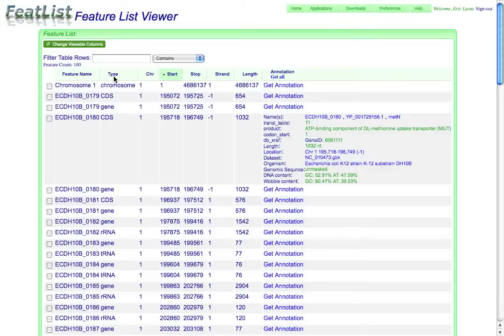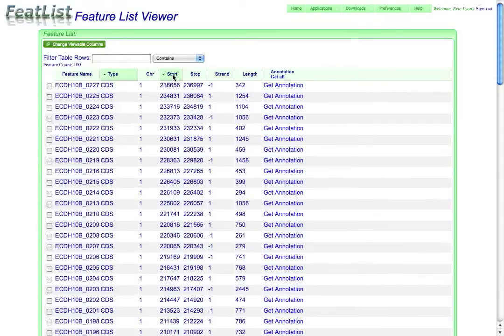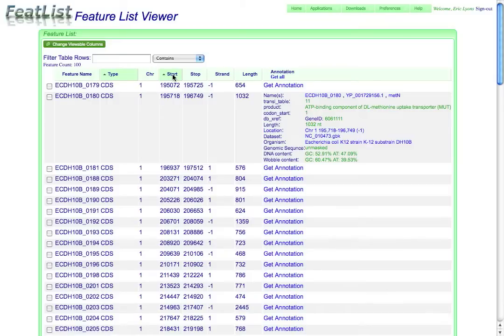If I want to do multiple sorts, for example, if I first wanted to sort by type and then sort by start, I select type and then I hold shift and click on start and I can do a secondary sort on that, as well as a whole bunch of other things.